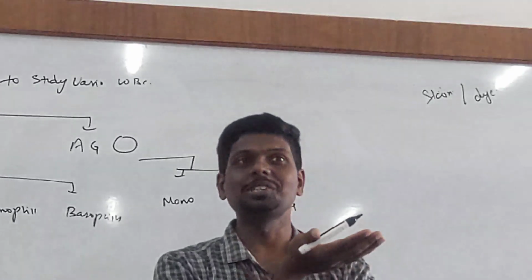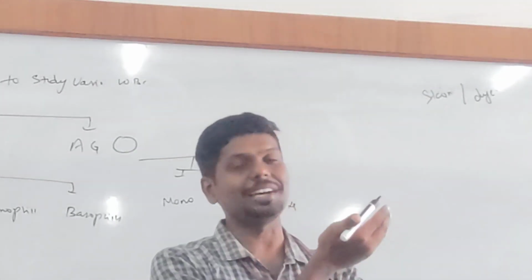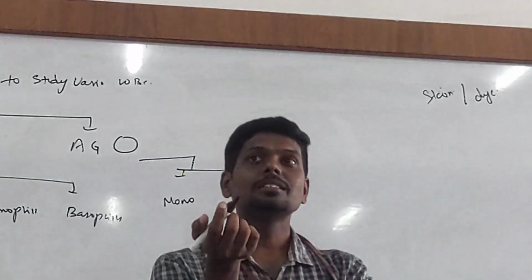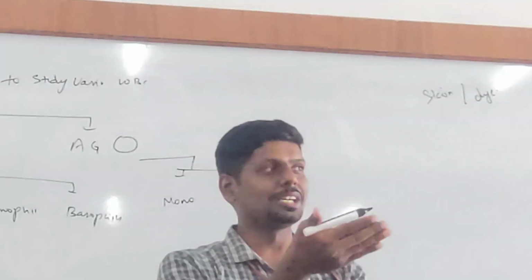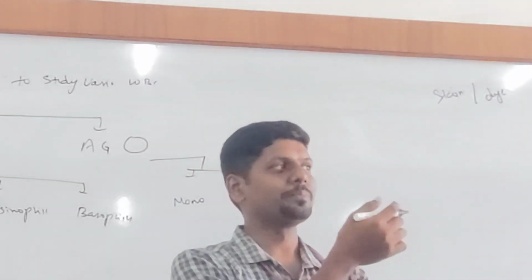So Srishtika is trying to say a stain is obtained from dyes. Then we can just say dyes, right? Why are we calling them a stain? Any other idea? A stain is the process of giving color to something, for microscopy.